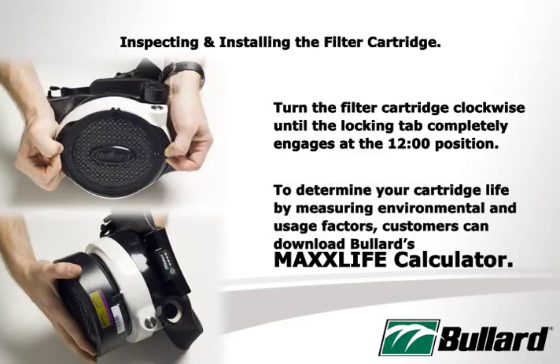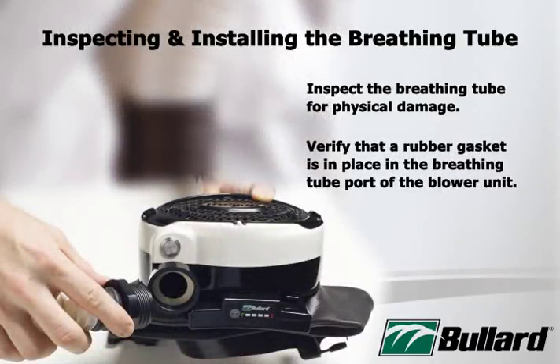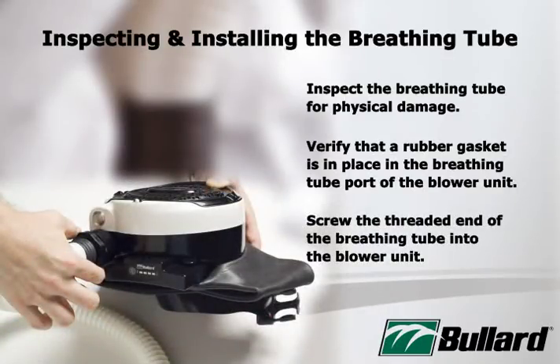To determine your cartridge life by measuring environmental and usage factors, customers can download Bullard's MaxLife calculator. Inspect the breathing tube for physical damage. You should always verify that a rubber gasket is in place in the breathing tube port of the blower unit. Screw the threaded end of the breathing tube into the blower unit; hand tightening is sufficient.